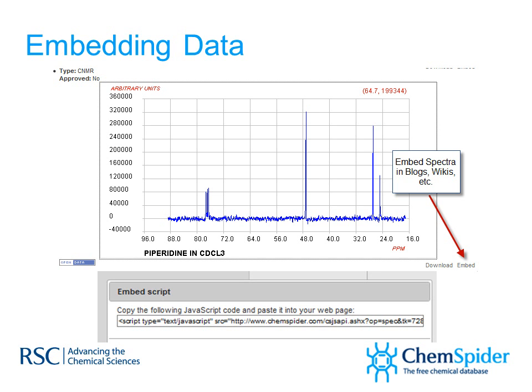We've also given the ability to embed the data, and by that we mean just like you would embed YouTube videos inside a blog post, for example. You might choose to put together a web page and you might want to use the spectra. All you would do is you would click on embed that comes right adjacent to the spectrum and copy this code right here, and it would show the spectrum inside your blog.